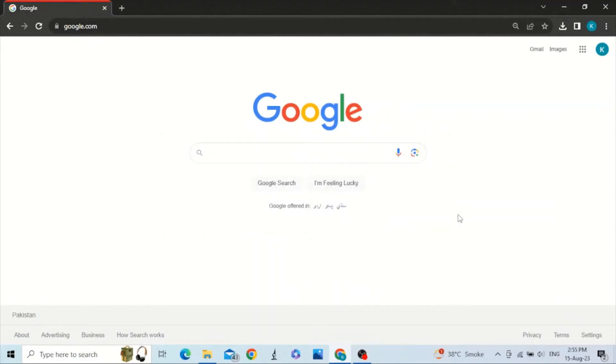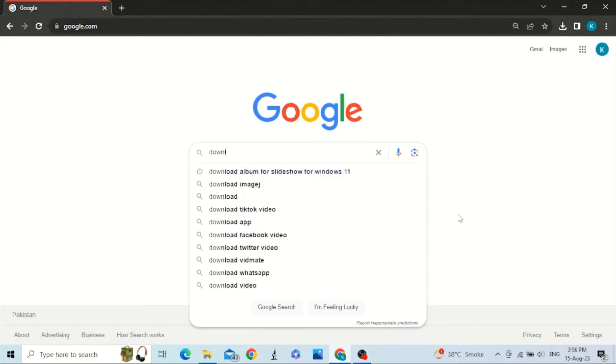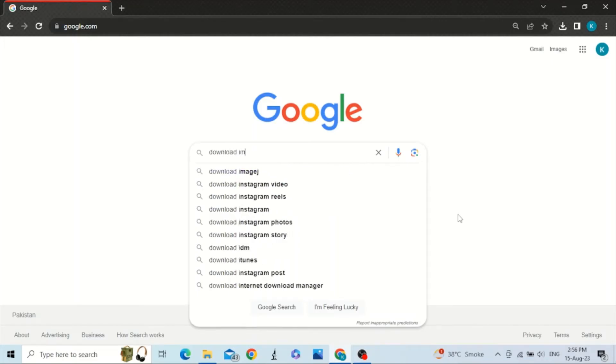Hello friends, in this video we will talk about how to download ImageJ from its website and then install it. For that purpose, go to Google and type download ImageJ.